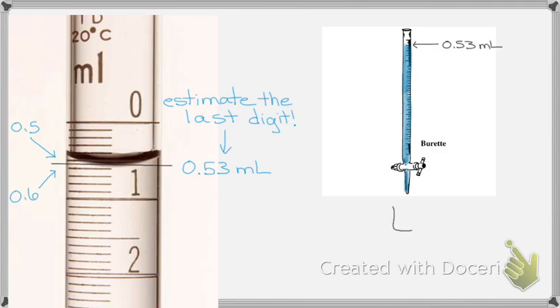We are going to take our beaker number 1 that we have already massed. We know that that mass is 51.346 grams. And we're going to drain the burette until we've put about 10 milliliters of the unknown into beaker number 1. So I do that. The next thing that you have to do is read the volume on the burette again. I'm not going to go through that again. I'm just going to tell you, you read it the exact same way. And this time, let's say the burette reading is going to be 11.24 milliliters.